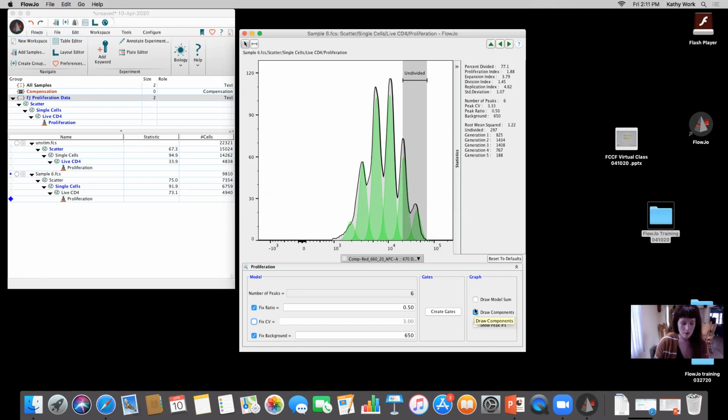Kathy, let me take advantage of that comment that you just made, because some people here were asking about the comparison of different dyes, in terms of durability, maybe even brightness or their efficiency. So do you have anything to comment on that?